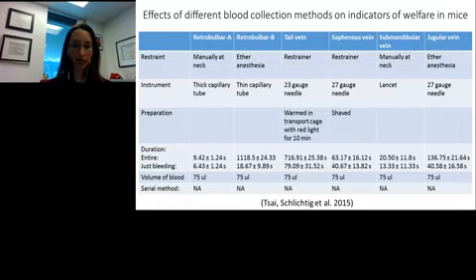So you can see that the retrobulbar method in awake mice was the shortest length of the procedure, and if we look at the anesthetized procedures, those took quite a bit longer. So to actually measure corticosterone, they took blood from one mouse from each cage for 6 days via the retrobulbar technique, and they averaged the corticosterone value, and they called that their baseline.